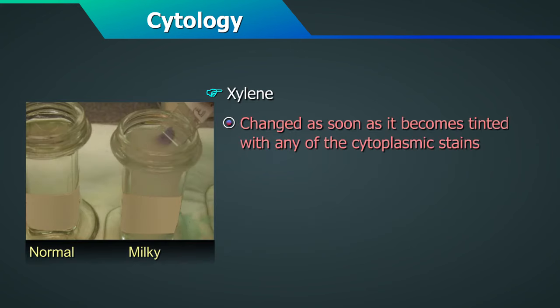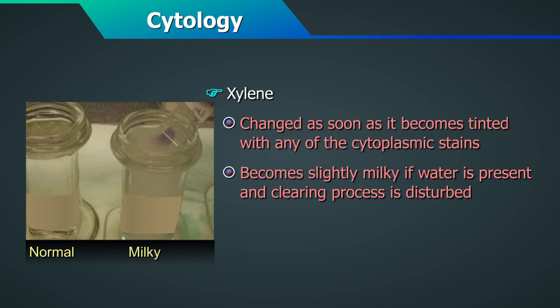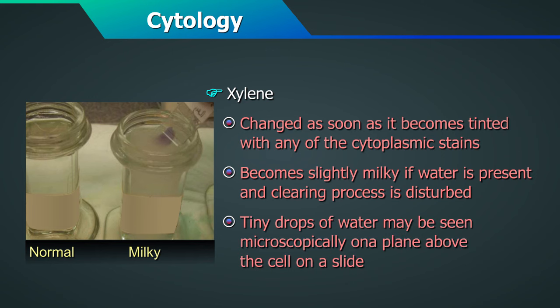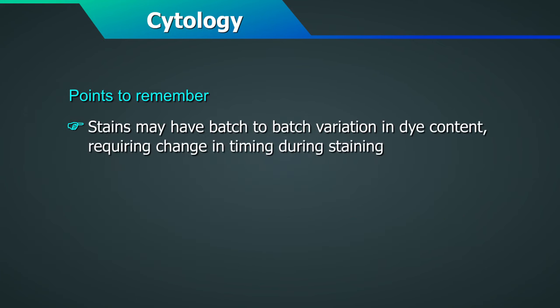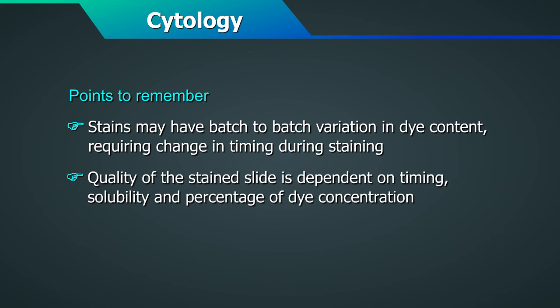Xylene should be changed as soon as it becomes tinted with any of the cytoplasmic stains. Xylene becomes slightly milky if water is present, and if so, the clearing process may be disturbed — tiny drops of water may be seen microscopically on a plane above the cell on a slide. Stains may have batch-to-batch variation in dye content, requiring changes in timing during staining. The quality of the stained slide is dependent on timing, solubility and percentage of the dye concentration.